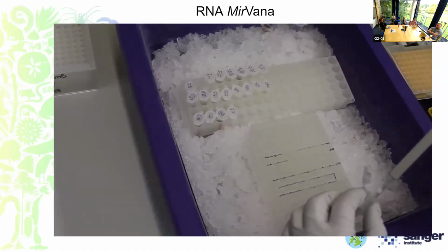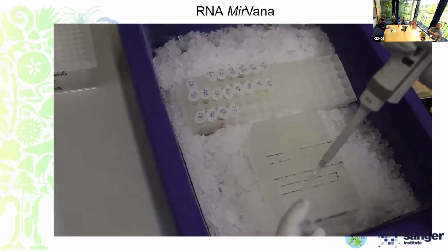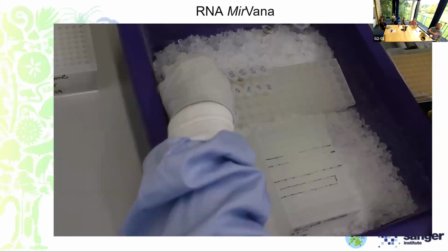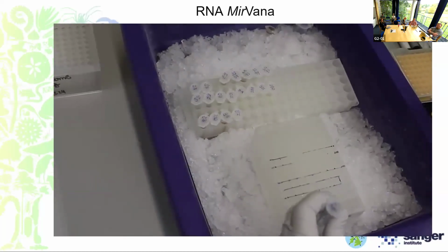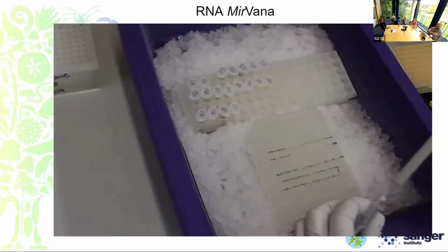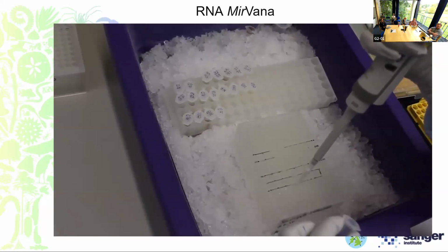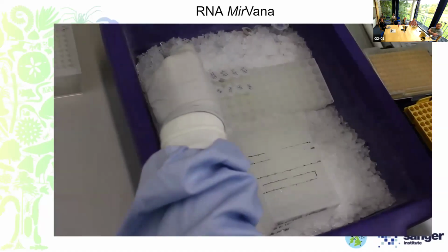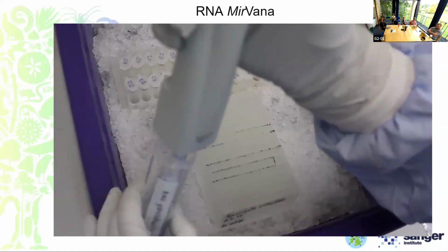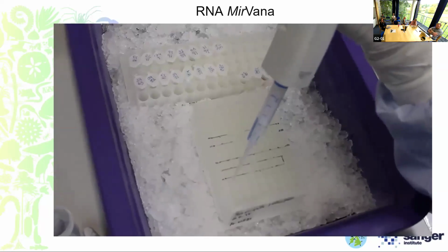Obviously, as it's RNA, we don't need to worry too much about it being high molecular weight or anything like that, so we can use normal tips for this transfer into the plate. So once we've added our 200 microliters of the lysate, on top of that, we then add 100 microliters of isopropanol onto each sample.